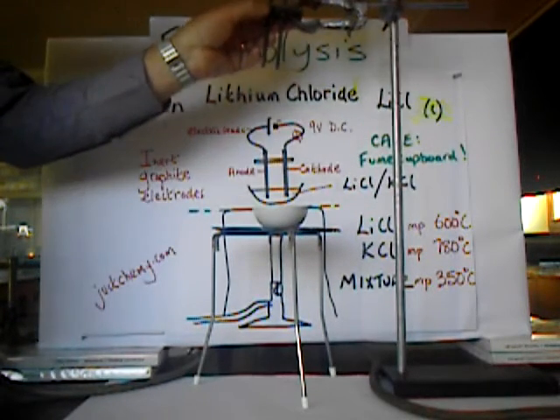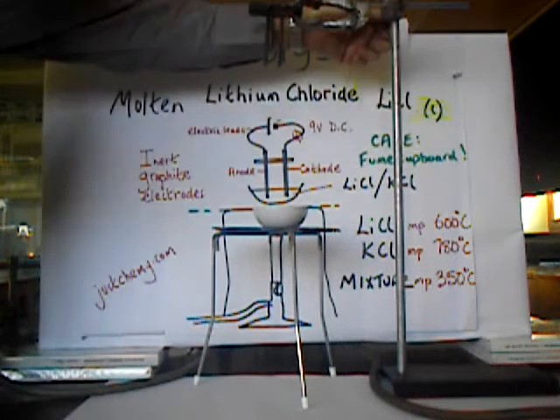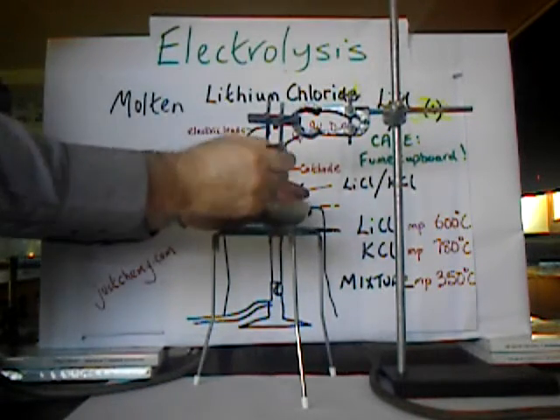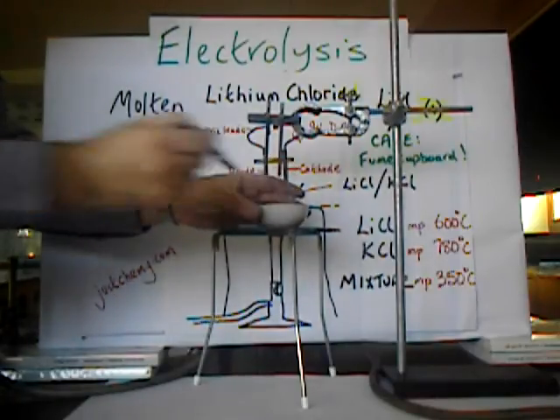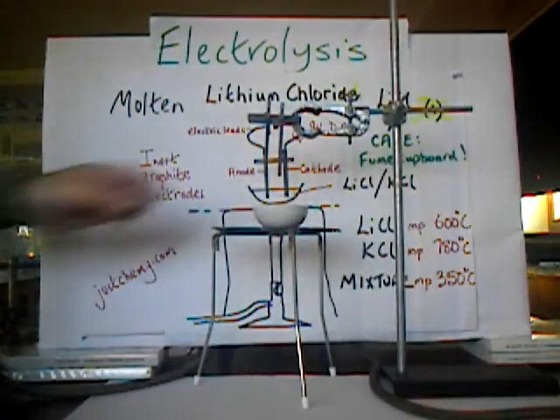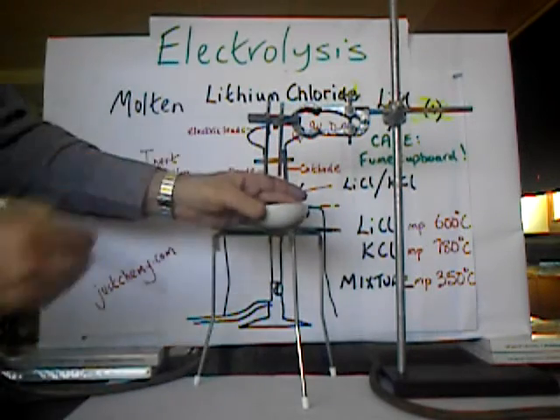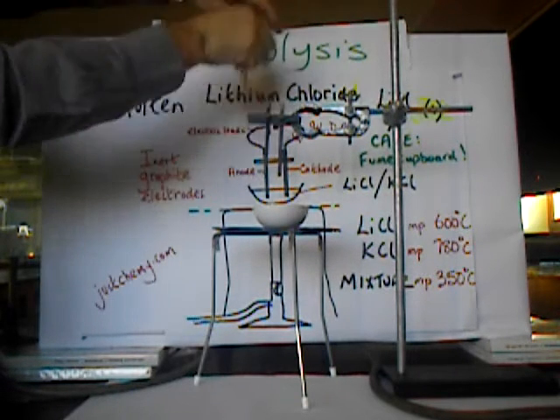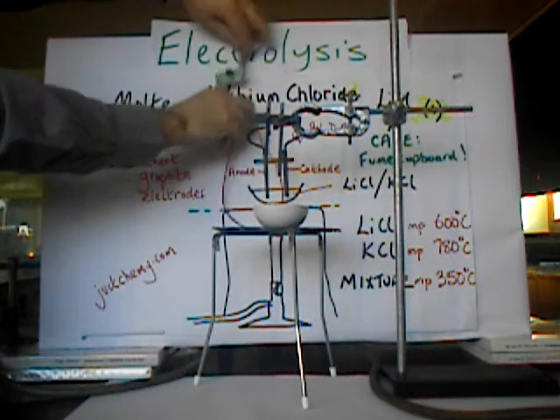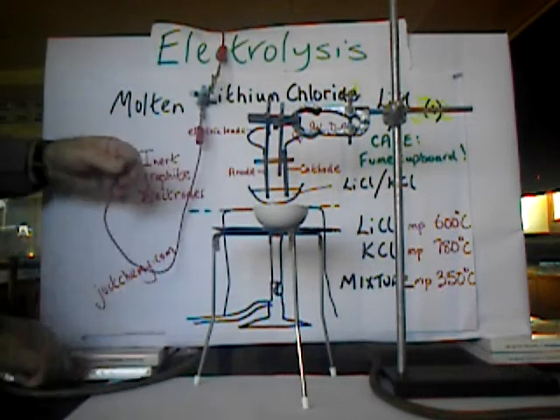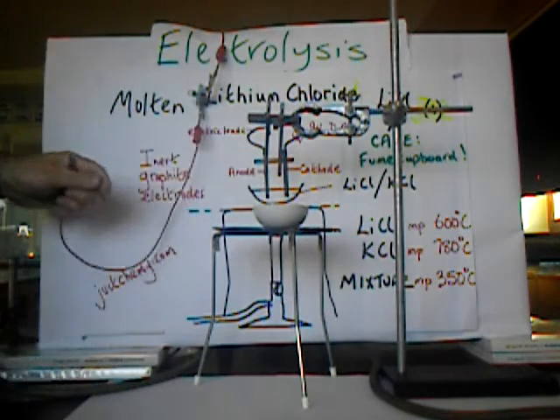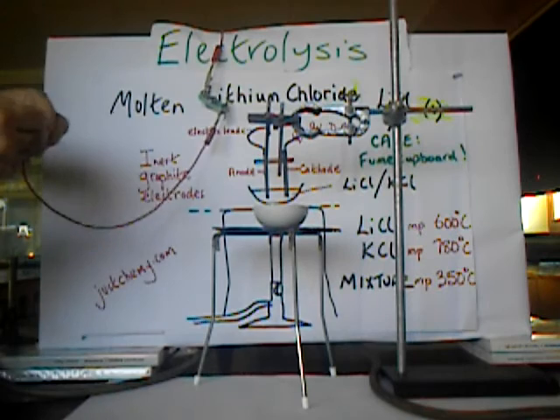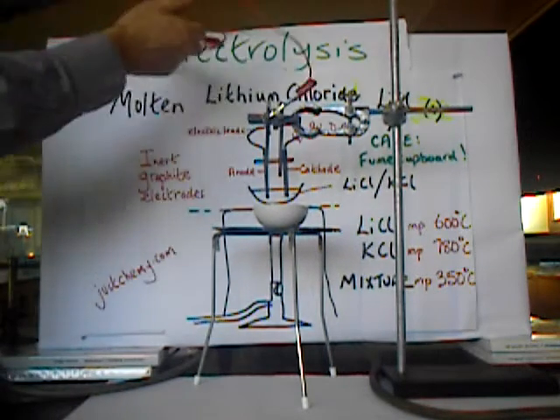I have a power pack set at 9 volts DC. We must use direct current. Can you think why? We want the electrode on the left to remain the anode and the electrode on the right to remain the cathode — we don't want the cathode and anode switching around. I've also placed a bulb in the circuit. I like to keep the anode on the left and the cathode on the right, just for consistency.